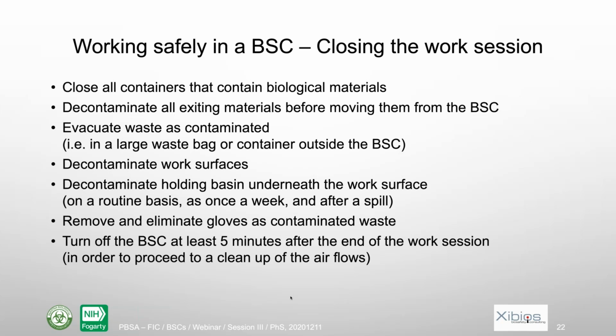And then you should still let the biosafety cabinet keep working for at least 5 minutes. Why? In order to keep cleaning the air flows during that time. And so those are all protections that ensure personal protection, the protection of your lab from contamination, and also product protection.